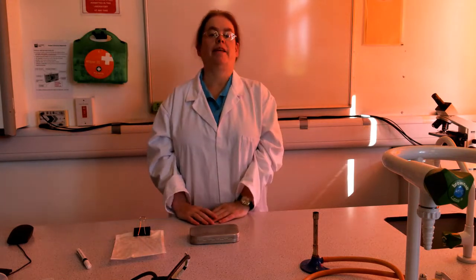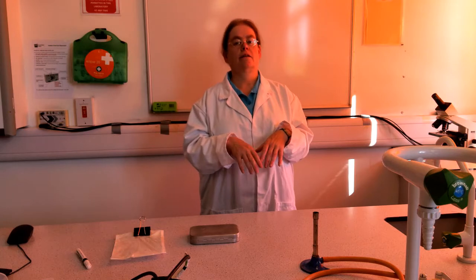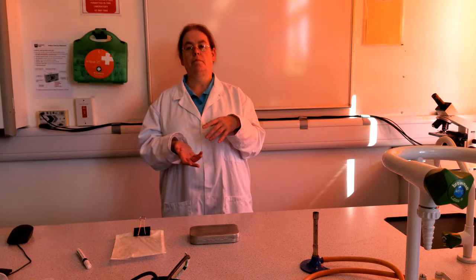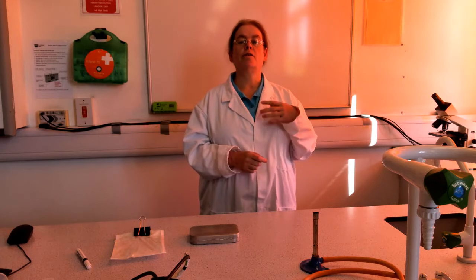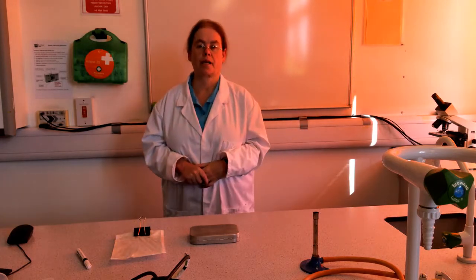One is simply you get a very fine filter, filter your liquid, bacteria are left in the filter paper, you dry the filter paper, you weigh it. That gives you an idea of how many bacteria. That obviously only works when there's a very large proportion of bacteria in the culture.